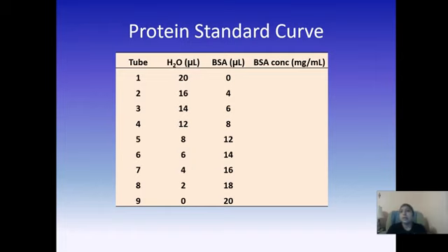Now, for the first lab, we are going to practice creating a protein standard curve given a purified protein sample, a standard protein, which is our bovine serum albumin. We are going to use it to practice graphing our standard curve and then choosing what would be the most appropriate function, the most appropriate equation to look at, given the way our absorbances turn out.